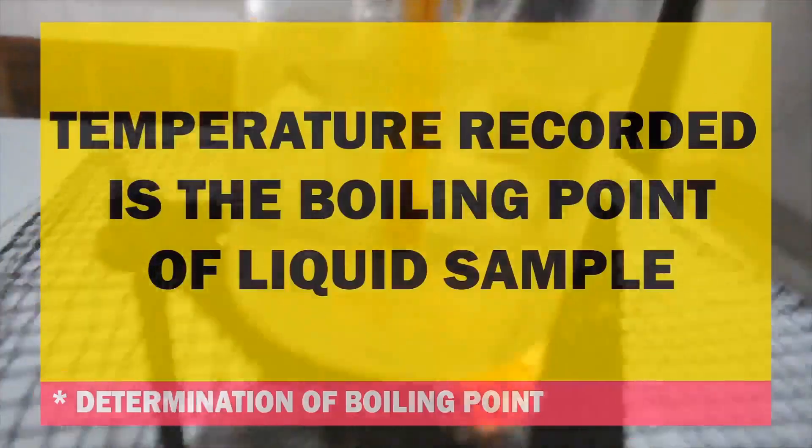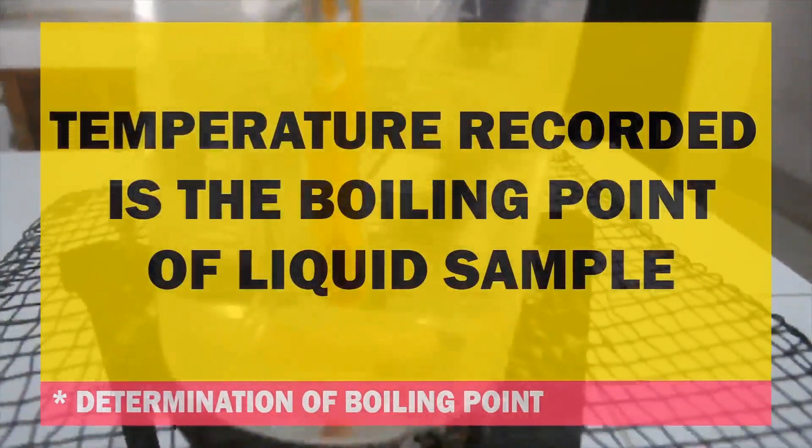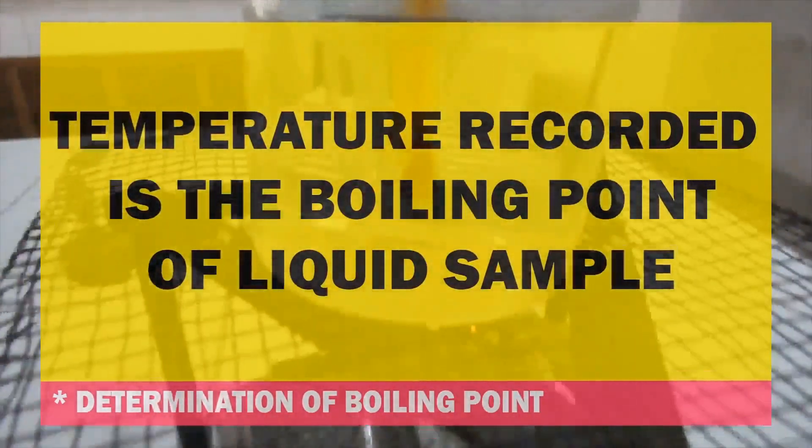The temperature recorded is the boiling point of given liquid sample.